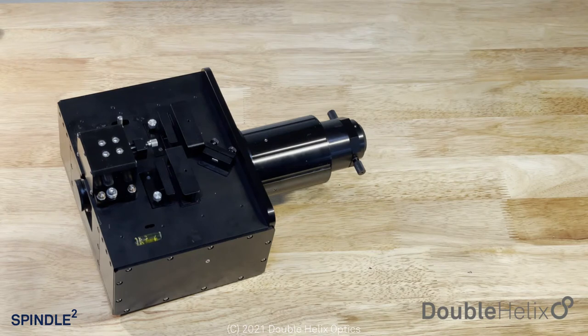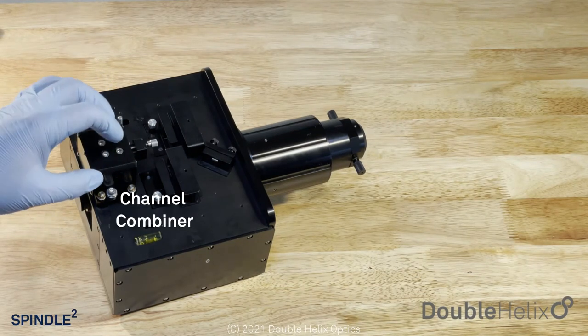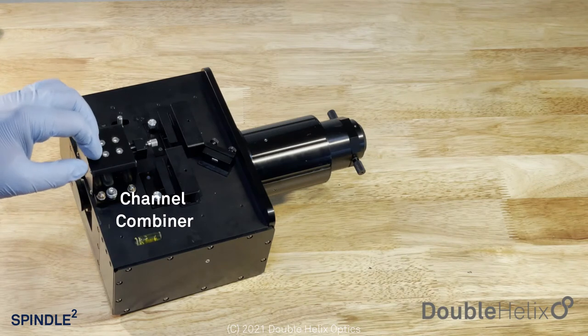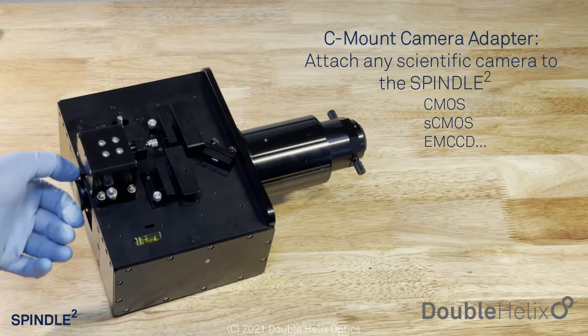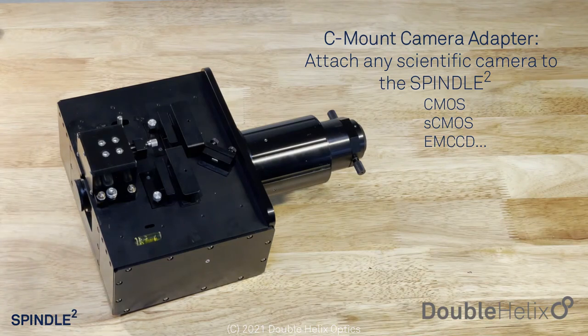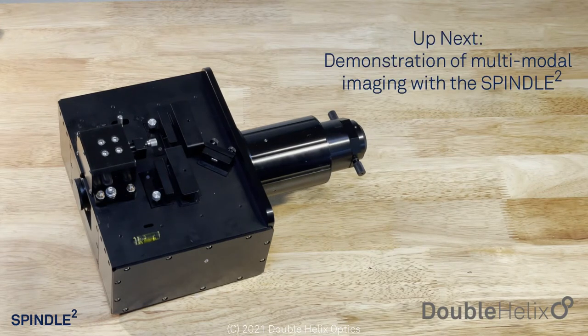There's a lot of versatility there. We have our two-channel combiner with a lot of different adjustment to get those two channels aligned really nicely. We have our C-mount adapter to go onto pretty much any standard scientific CMOS camera. Those are the main features of our Spindle Squared module. We'll switch back over and get the system installed onto a microscope so you can see it in action.